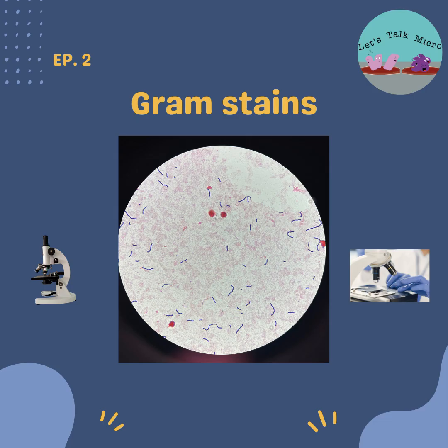As you progress in your career, all these organisms sometimes have similar morphologies. So do not assume that because it grows on a certain plate, certain agar, it is a specific organism. The best example is white colonies. This is the most common mistake that new techs, or sometimes not new techs, make, because they don't want to take the extra time to do the gram stain. See the white colonies, you assume that it is coagulase negative staph. You set up the ID that way, set up susceptibilities. You might get the wrong ID, and this is all because you didn't take the time to actually make a smear. White colonies can sometimes be gram positive rods or yeast.